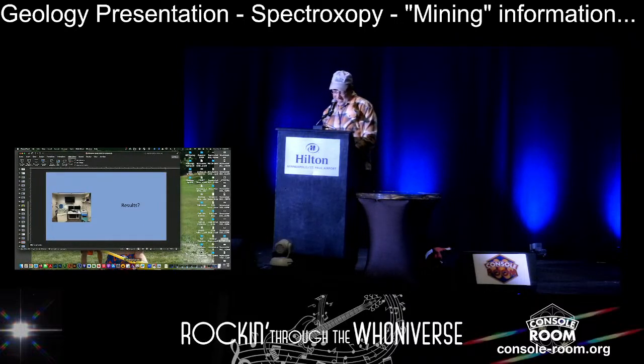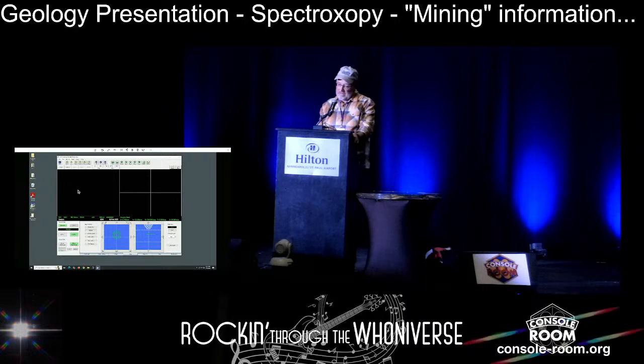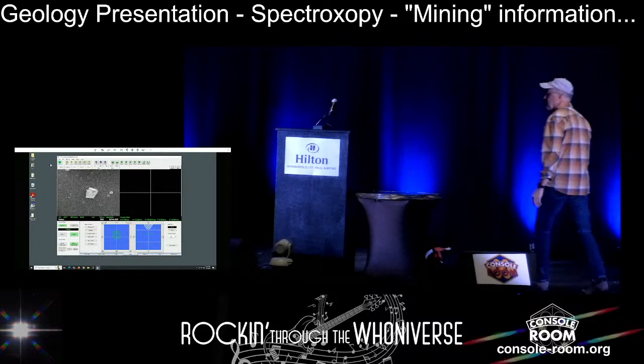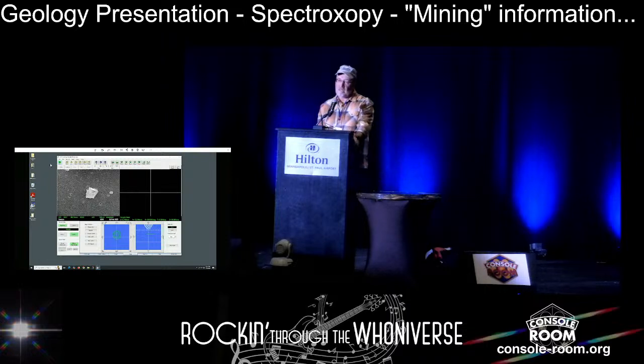All right, so I've connected to the scanning electron microscope, and I've put a sample in there that is this particular mineral. So this is a piece of that mineral at 30 times magnification. I can go up to 100. I can go 1,000, but we're going to lose any semblance of where we're at. But at 100, and then I can mess with this.